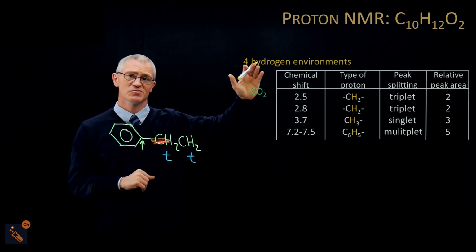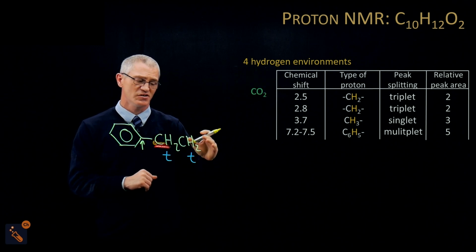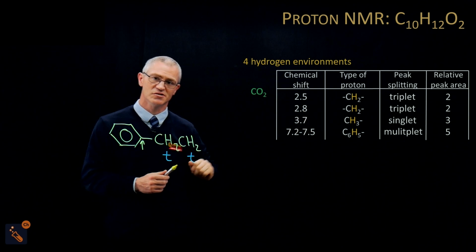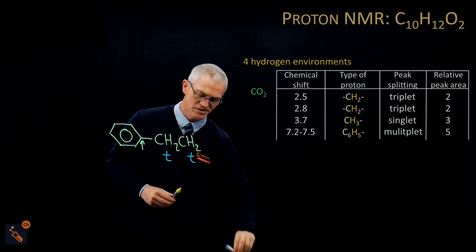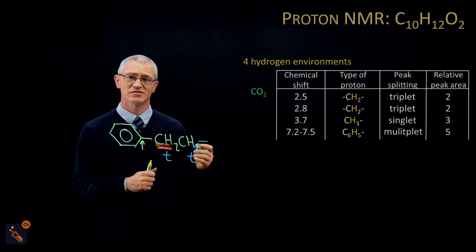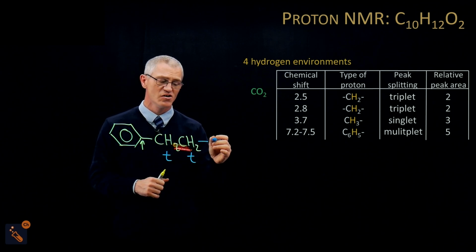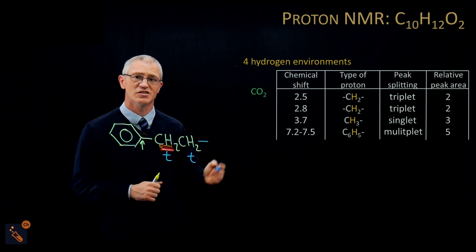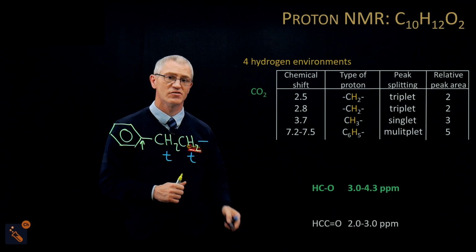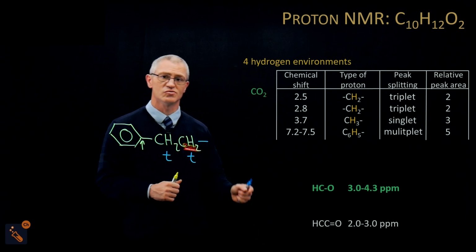So basically, I'm looking here and I've got CO2. I think my CO2 is going to go in there because the only thing left after that I have is CH3. Okay? So if that is the case, how does my ester actually bond to it? Is it the single bond oxygen or the double bond oxygen? So to do that, we have to look at here and we have to remind ourselves of these two rules.